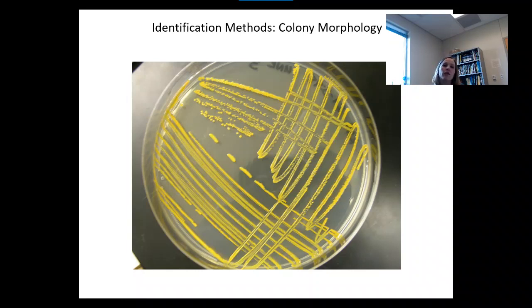An interesting thing with colonies is that they're distinct for different organisms. E. coli's colony has a distinct color and shape and texture that's different than Staphylococcus, that's different than Streptococcus. So with experience, the way that they actually look on the plate, called the colony morphology, can give you clues to help you eliminate all the different options out there to figure out what it is that is causing your patient's illness.